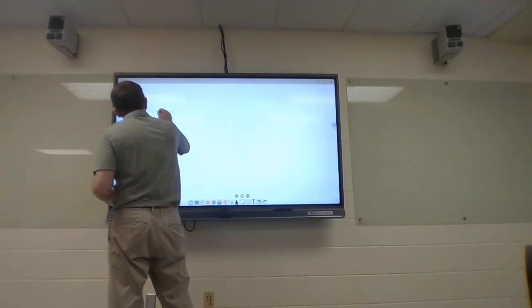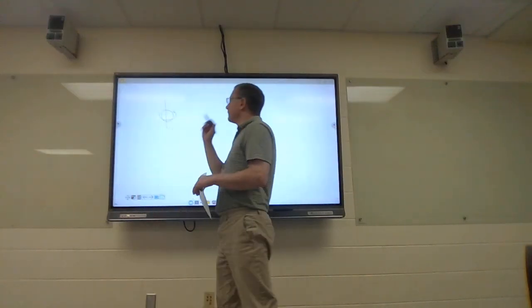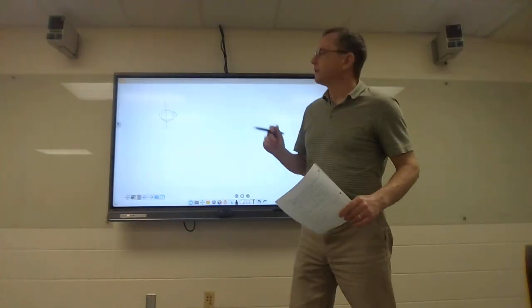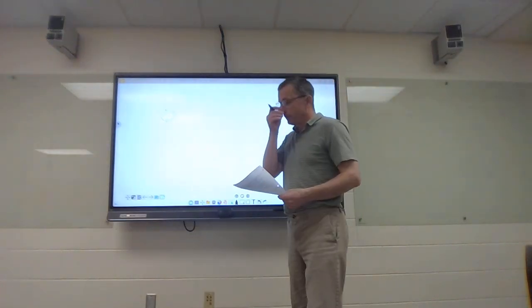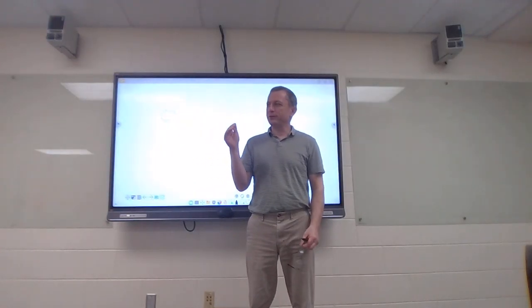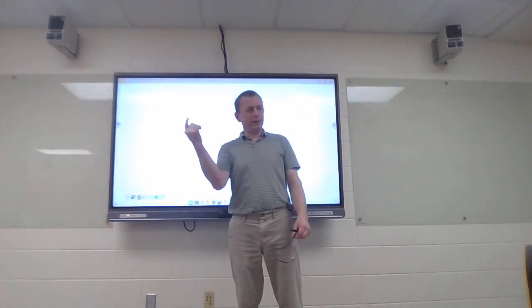Okay, so we can kind of think of it on an axis, and it's spinning on that axis. Well, the nucleus has a plus charge. What we do know from physics is what happens when we have current. And I think I've mentioned this to you before, maybe in the other class. What happens when we have current moving in a circle, in a loop? It creates a magnetic field.